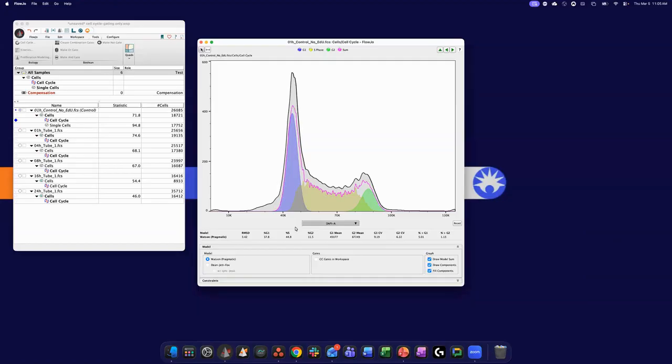So if the user before you didn't do a very good job of cleaning the machine, their DAPI could contaminate your experiment and give you false estimations of DAPI content. So it's never a bad idea, I think, to just do a little bit of a rinse wash before you put your sample on the SIP, if that's what you're asking. I think that's a good idea. All right.